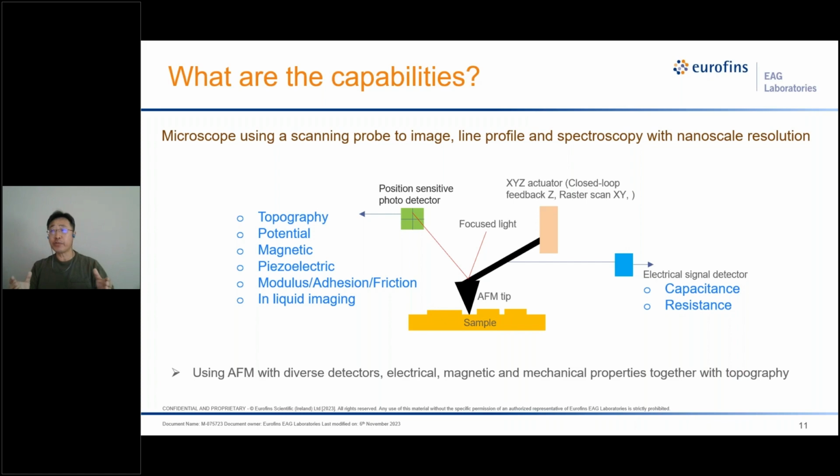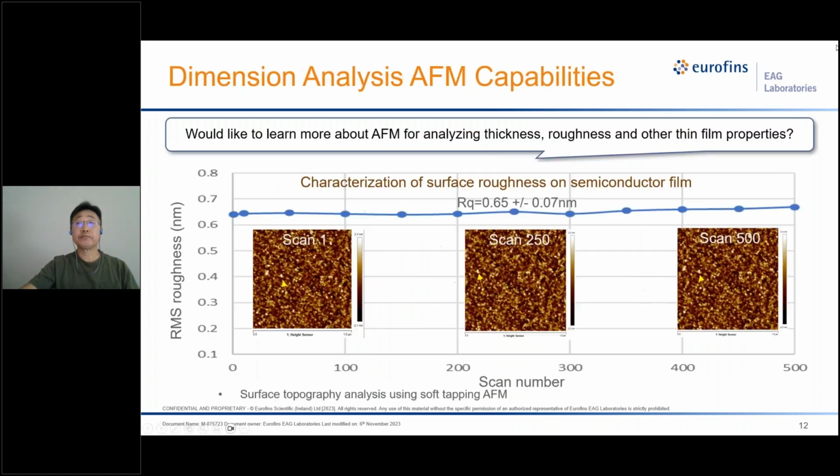Again, with AFM, you can investigate many physical properties in the same area you take the topography. You can do that with blanket samples or patterned devices, which may be available as received in planar form or prepared in cross-section geometry. In the following slides, I'll be introducing a few examples.